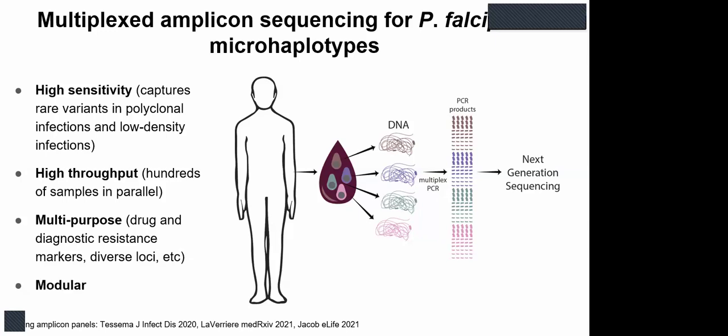And it's also created in a modular format, whereby there is a diversity panel, a diversity group of amplicons, resistance amplicons, diagnostic resistance amplicons, among others.